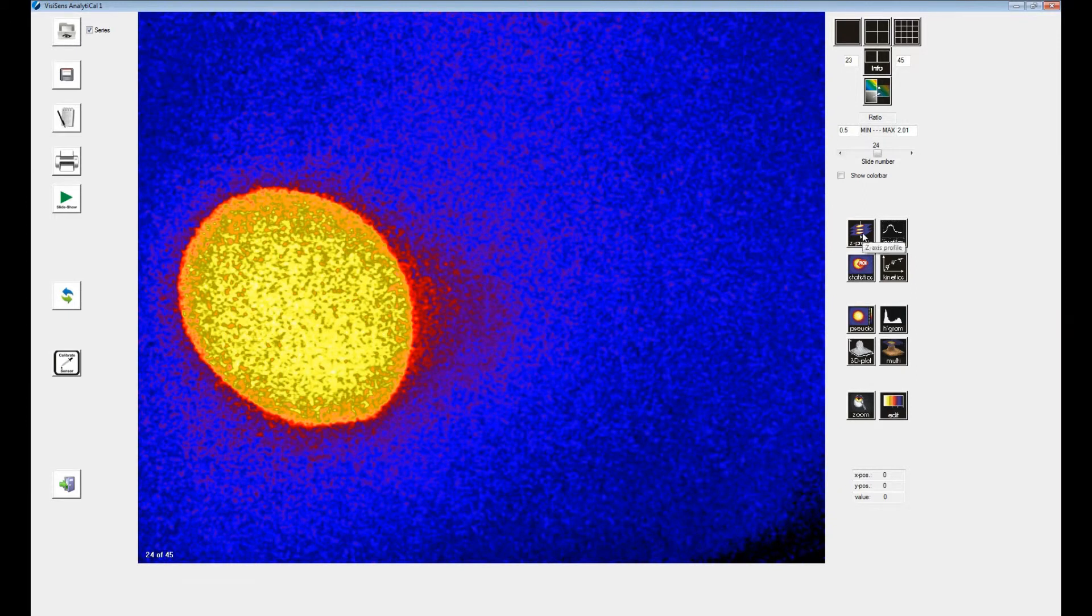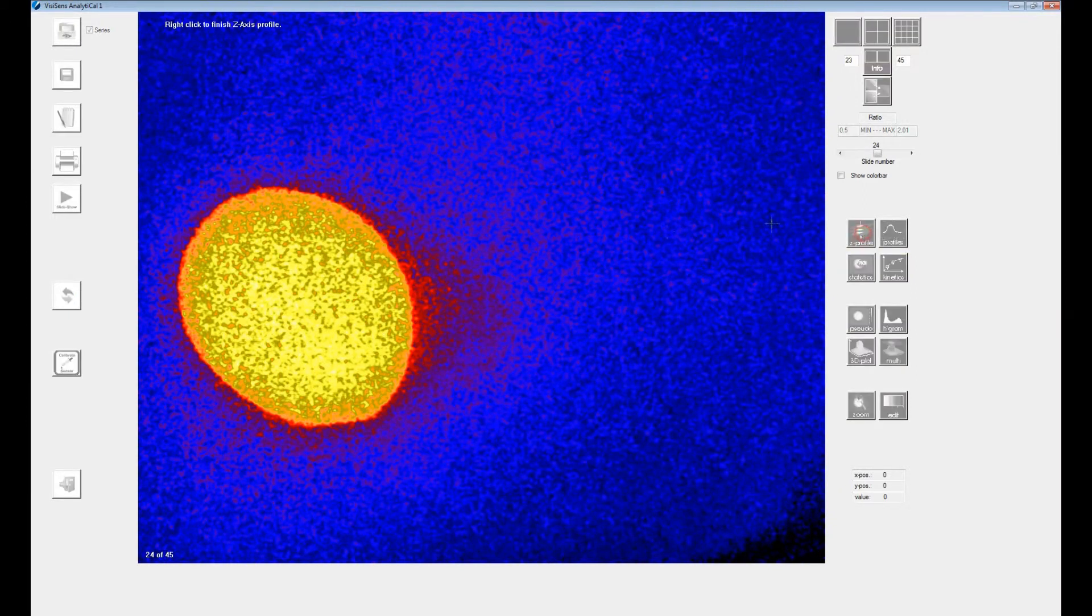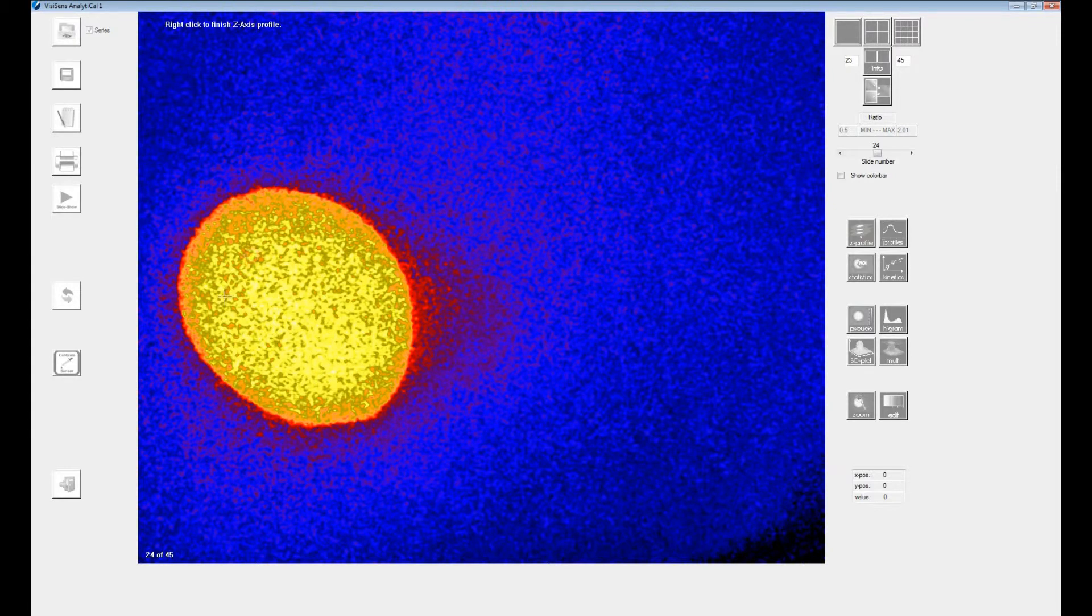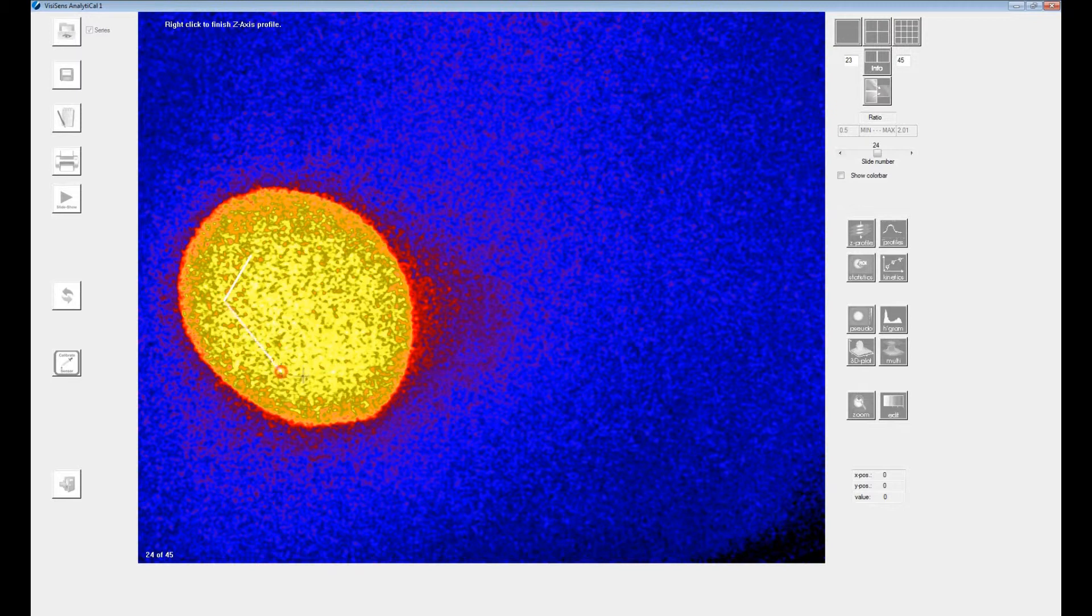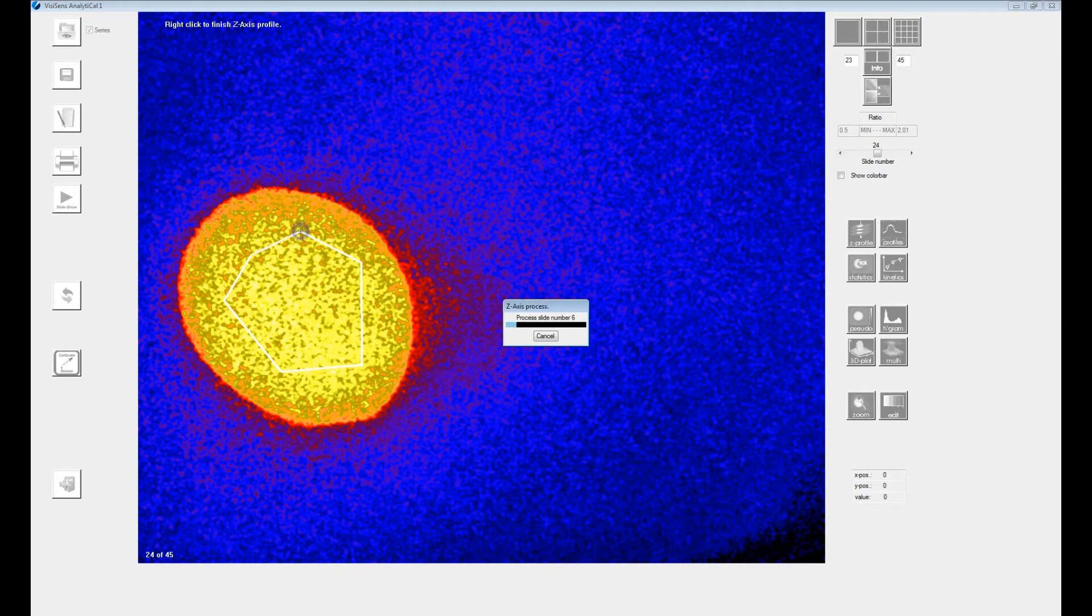The evaluation function set-axis profiles will calculate and display a graph of average values in a certain region of interest, and this for all uploaded images. You are able to select the region of interest with left mouse clicks. Close the polygon with a final right mouse click.